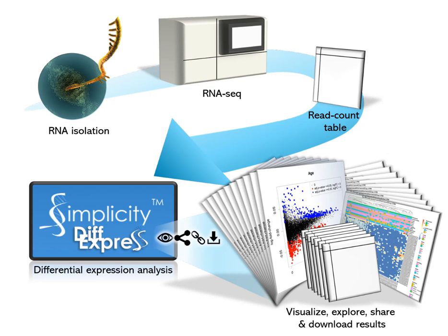Hi there, today I'm going to present to you a tutorial on how to use Simplicity DiffExpress, a platform for differential expression analysis of RNA-seq data.